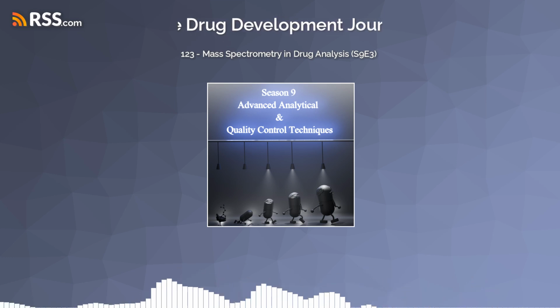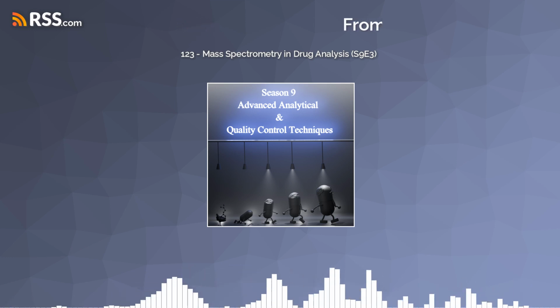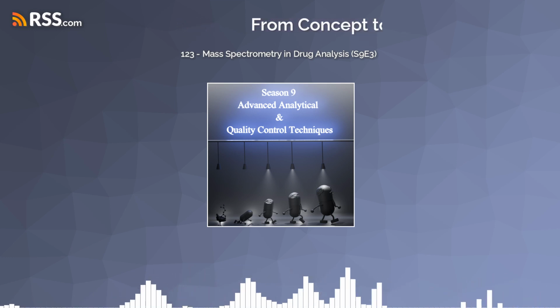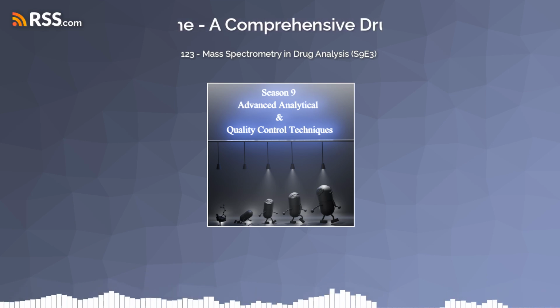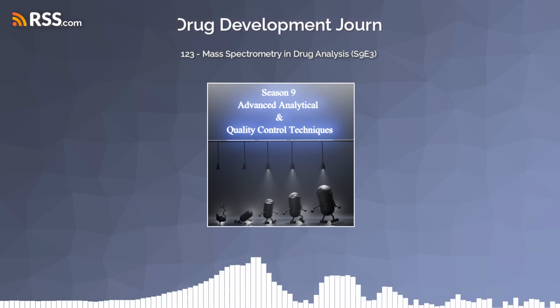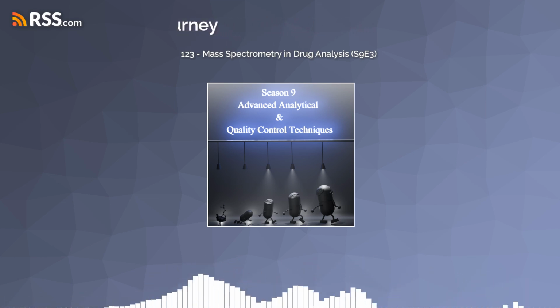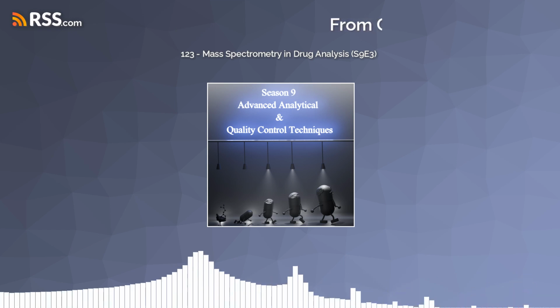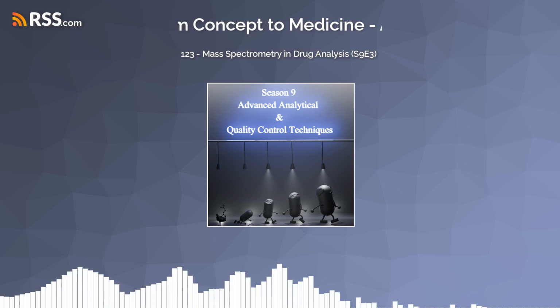We'll also be talking about the different types of mass spectrometers. Because there isn't just one kind, there are quite a few. And each one is kind of like a specialist, designed for different analytical challenges. And I guess, like any good detective, a mass spectrometer needs to be sharp. So we'll be figuring out what makes one truly effective. So we'll be talking about resolution, its ability to tell apart very similar molecules, and sensitivity, its power to detect even minuscule amounts of a substance. It's all about being able to spot the tiniest clues, right?